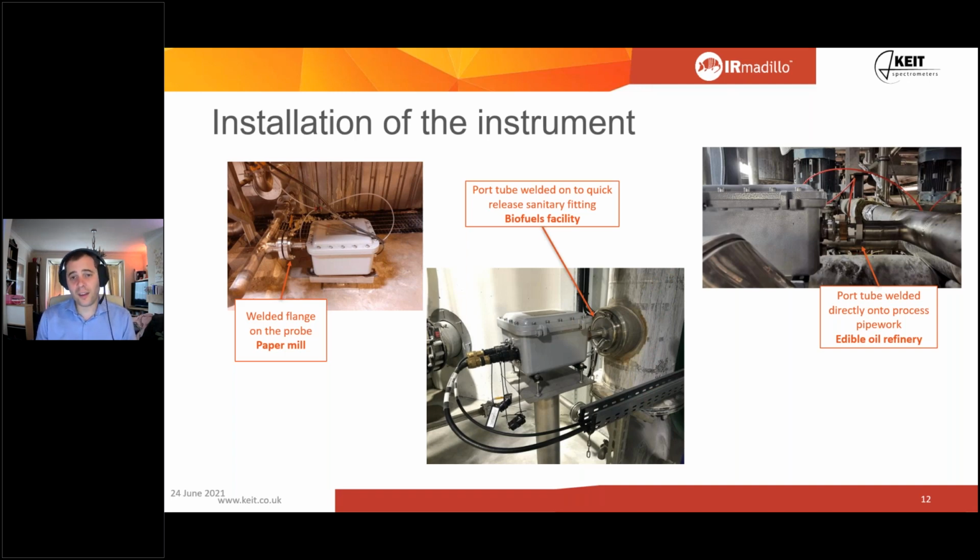So they still take HPLC because everyone's so used to doing it, it's what they do. But they use the spectrometer in between. So the HPLC is every 8 hours, but a spectrometer is every 2 minutes. So they use that to get kinetics, dynamics. They can spot problems before they happen. Bacterial contamination, have they added the right amount of enzyme, that kind of thing.